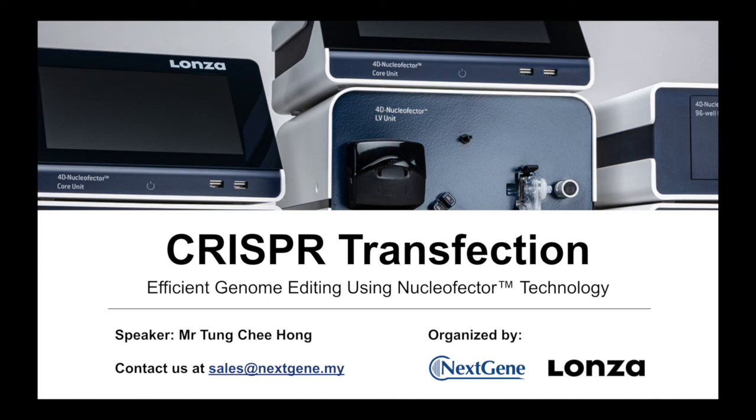Yeah. So another thing I would like to highlight is that when using different Cas proteins, we have different PAM sequences. Unfortunately, when we are using the Cas protein, we have one restriction, which is that the targeting site has to be followed by a PAM sequence. For example, for Cas9, we need to follow with NGG. N stands for A, T, C, or G, so it's either AGG, TGG, CGG, or GGG. For Cas12, they have a different PAM sequence. However, the designing software should automatically look for this particular PAM sequence.